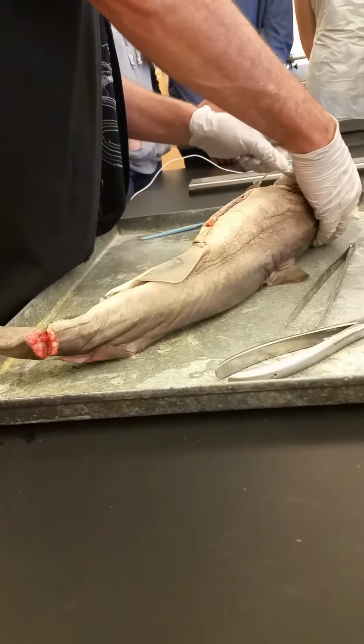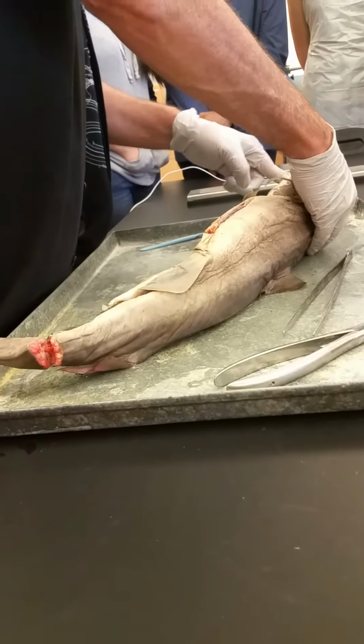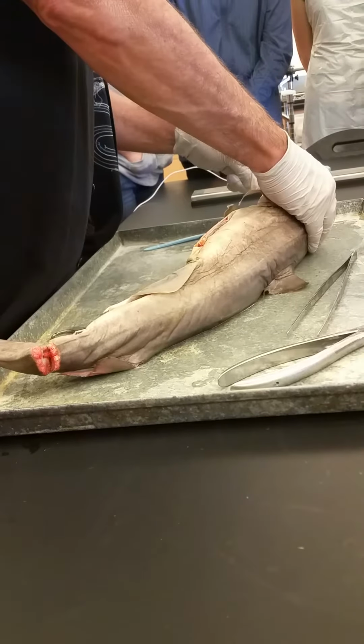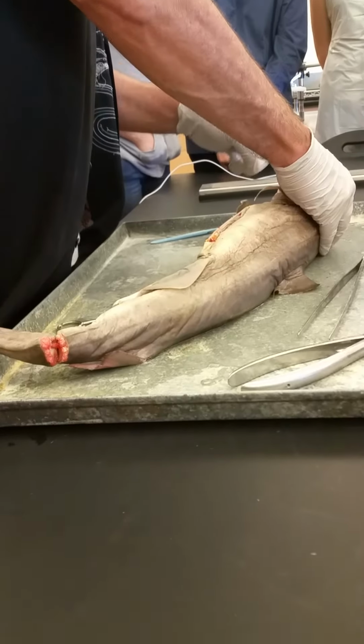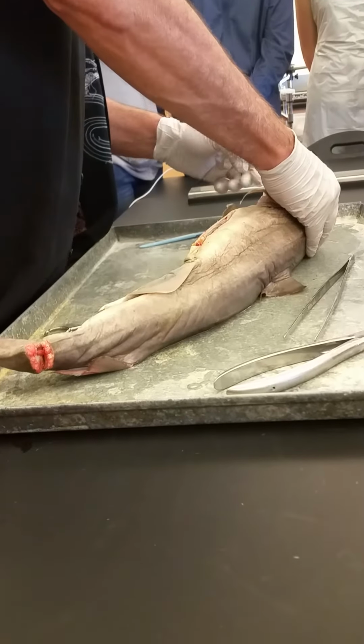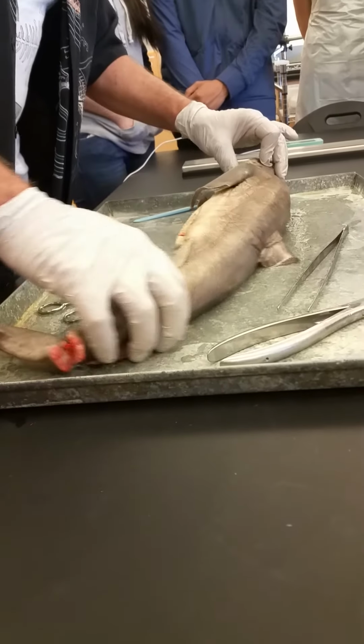And again, the nostrils, whereas on the bony fish tend to be on the top of the head, on the sharks and rays tend to be on the bottom of the snout here. But again, two openings on either side. So again, water flows across that. It's purely sensory. They don't breathe through it. Okay. Let's see, what else should we look at?